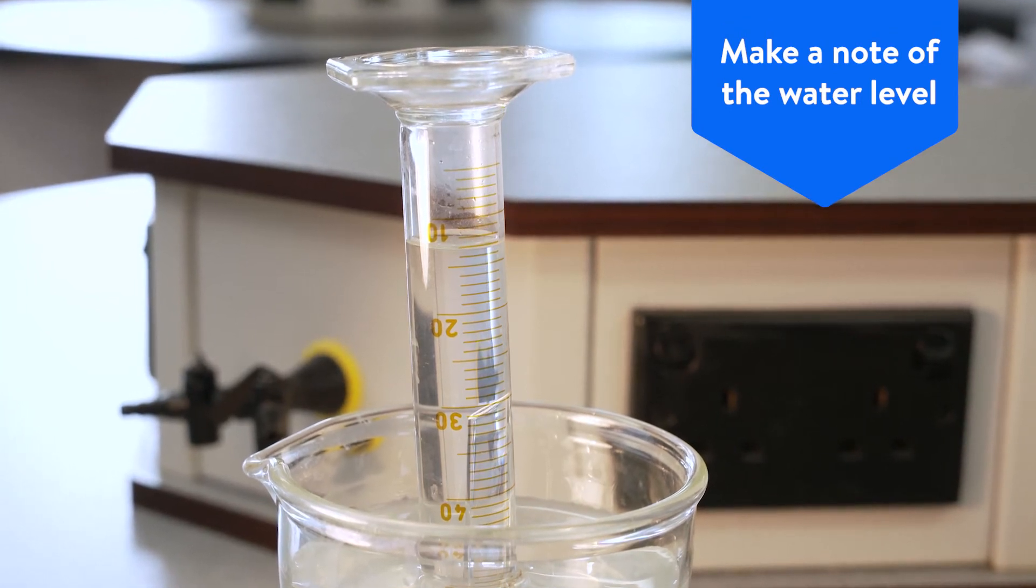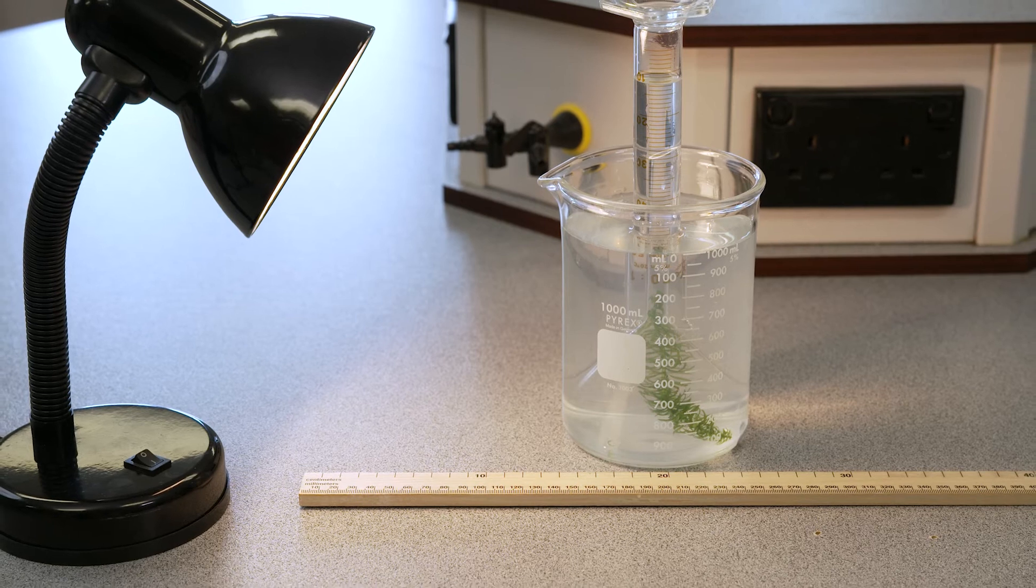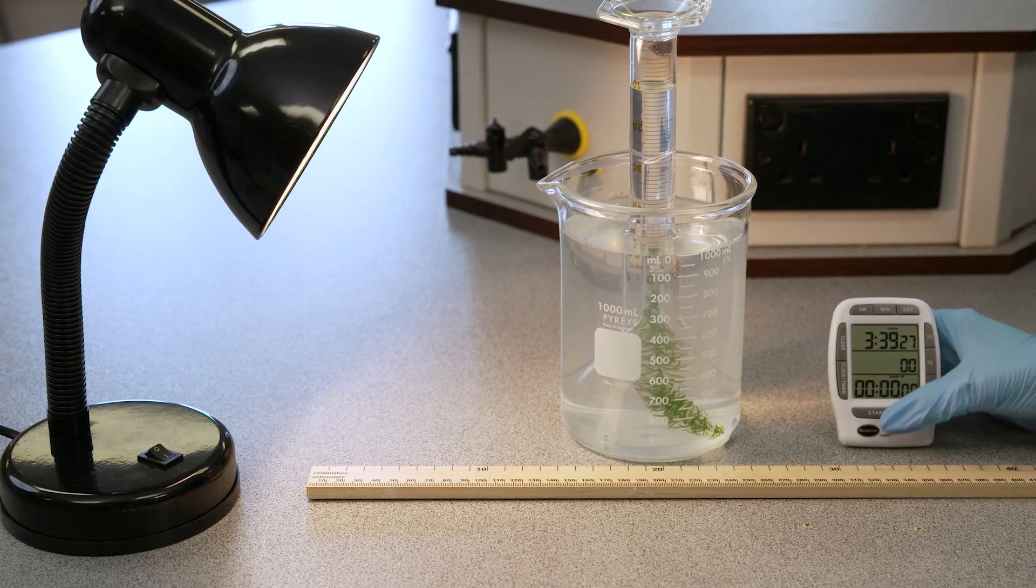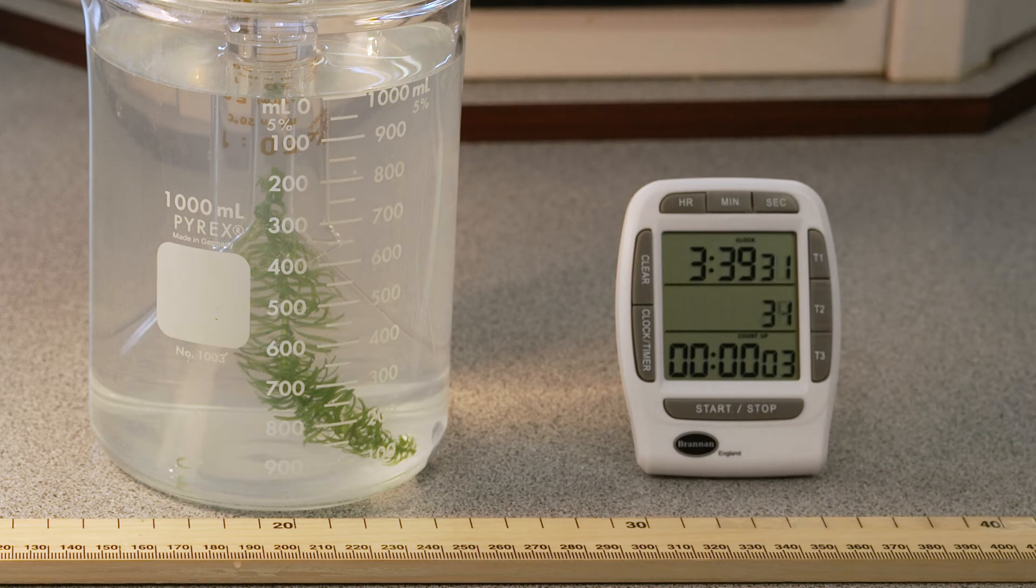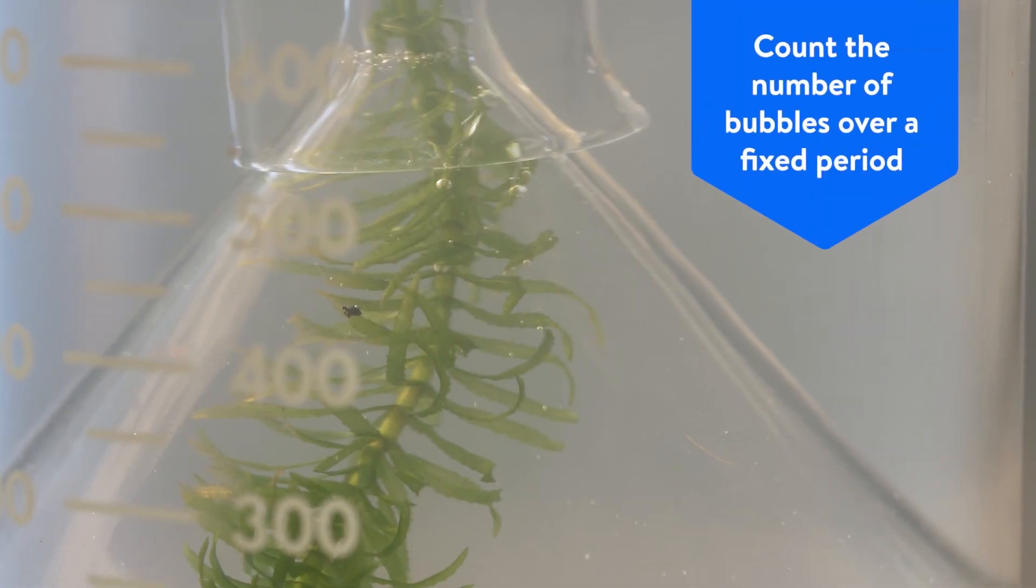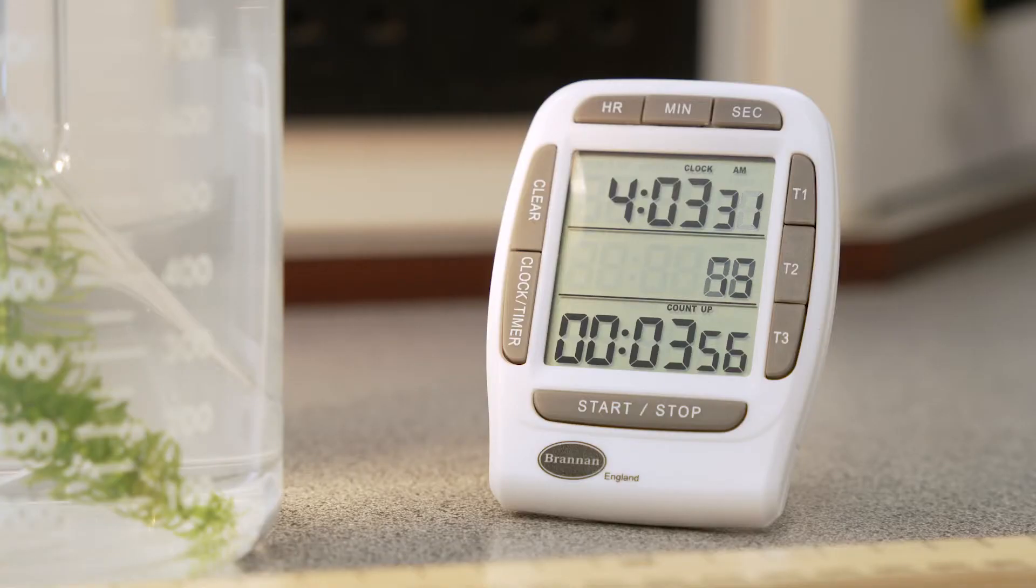Once you have your apparatus ready, give the apparatus time to acclimatize to the lighting. When ready, start your stopwatch and count the number of bubbles produced in a fixed period of time by the pond weed. We recommend a time period of four to five minutes.